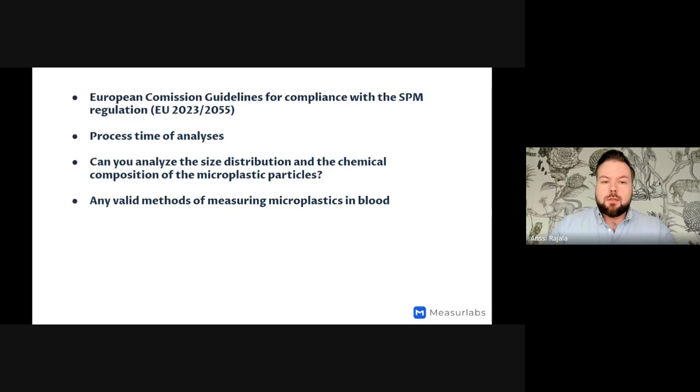Also, this needs extra documentation, basically to provide the information for the customs and the laboratory that the samples are from willing individuals.